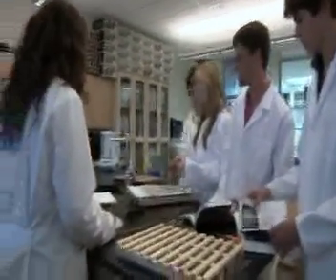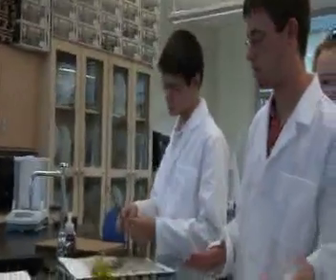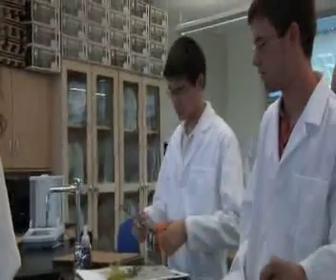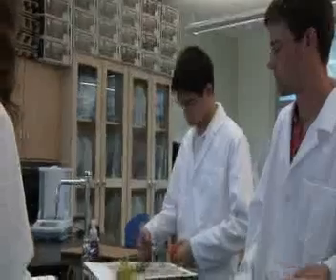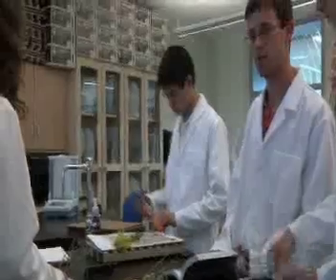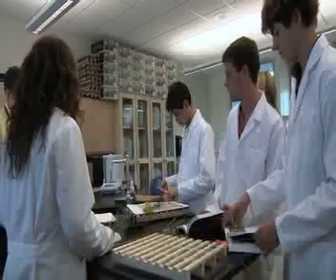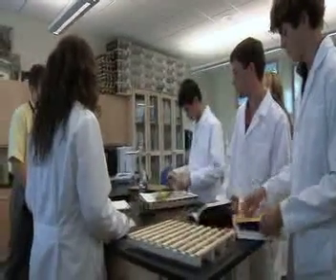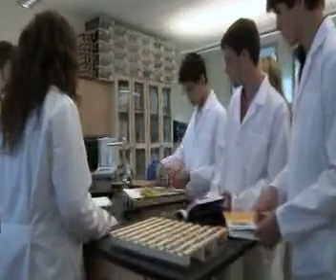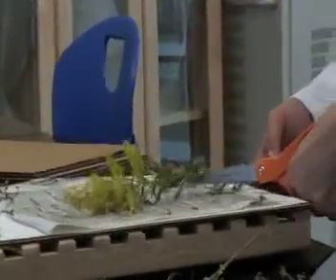Basically, the purpose of pressing this is to get them flat and then have them dry out so you can preserve them and look at them at later times as a reference, or keep them if you need them for some type of research. What he's going to be doing right now is cutting it down into smaller sections so that it'll fit on the paper that we have for it, and then we will be pressing it. What he's doing now is cutting off all the excess vegetation that's not needed to identify it. Then, once he's done with that, he'll lay it flat and cover it with a newspaper and then another piece of cardboard.